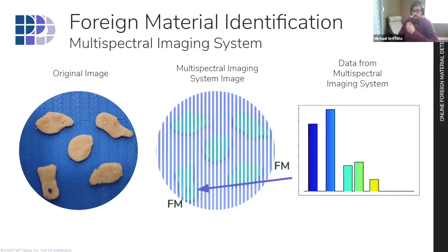Now, moving on to multispectral imaging. These systems utilize a lot of the same construction and principles that Priya had discussed. However, instead of looking at the complete spectra, these systems are tailored by design, based on laboratory experiments, to find out specific wavelengths of interest. So instead of looking at the hundreds of colors within those wavelengths, you are looking at a dozen or so.